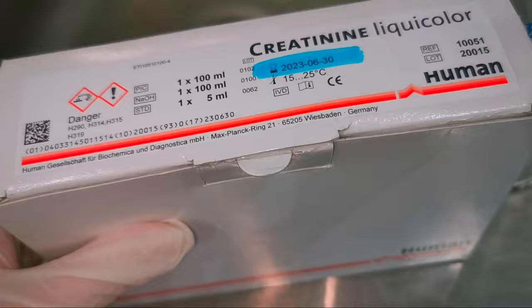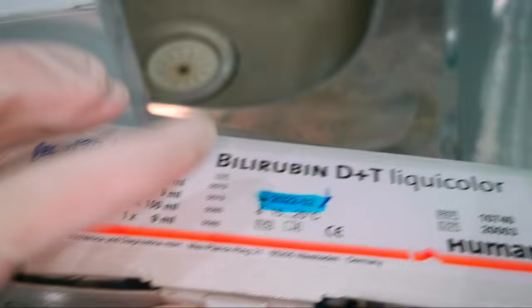On the other hand, these are the reagents that need to store at room temperature, creatinine and bilirubin.